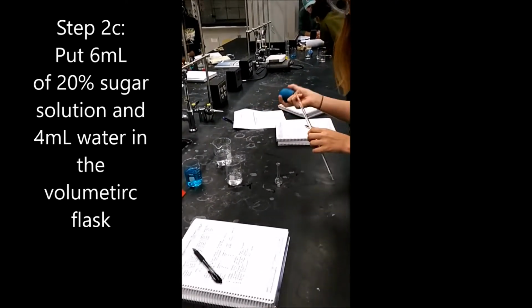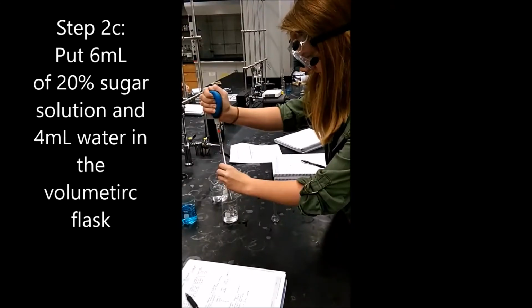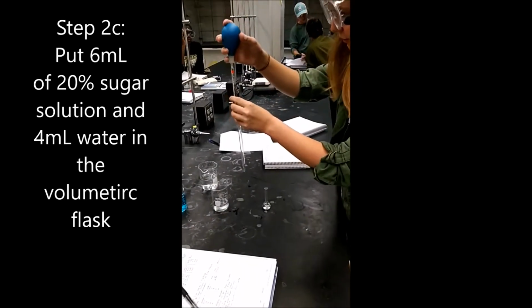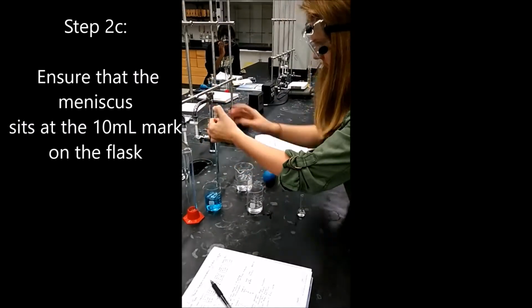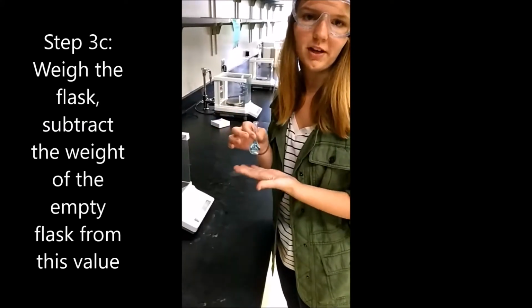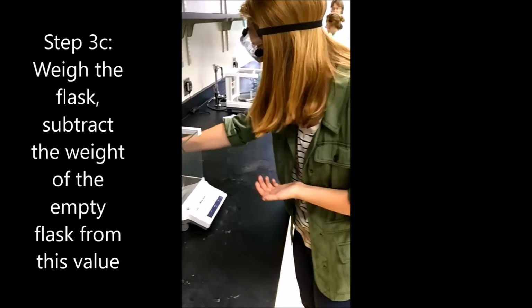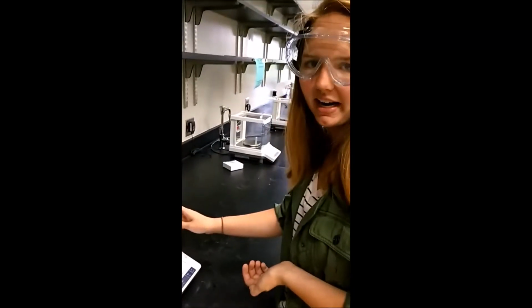Now measure 6 milliliters of the 20% sugar solution and fill up the flask with another 4 milliliters of water. The volumetric flask with the 6 milliliters of sugar solution and 4 milliliters of water weighs 19.918 grams.